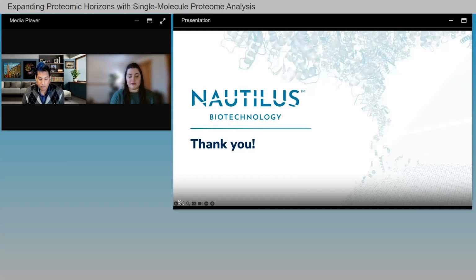When any given probe is fluorescently labeled and binds, the fundamental data from the instrument is those digital starry sky images that I showed earlier. And so really the heart of the platform is being able to immobilize individual protein molecules, probe them with any affinity reagent that is fluorescently labeled, take a picture, and then iterate. And so if those probes recognize whole regions of a protein or 3 to 4 amino acids or post-translational modified regions, the actual assay is identical.